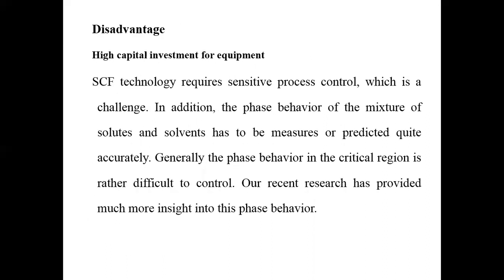required. The disadvantage: high capital investment for equipment. Supercritical fluid technology requires sensitive process control, which is a challenge. In addition, the phase behavior of a mixture of solute and solvent has to be measured or predicted quite accurately. Generally, the phase behavior in a critical region is rather difficult to control. Our recent research has provided much more insight into this phase behavior.